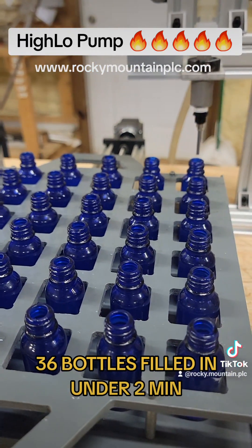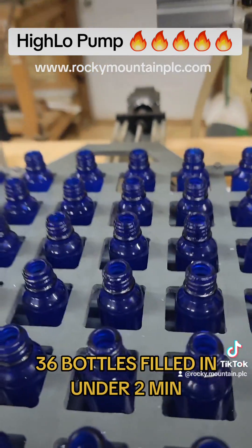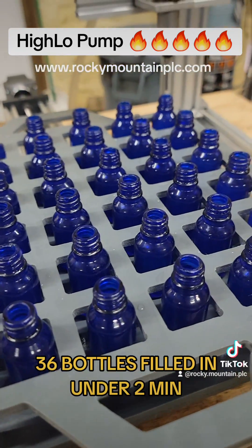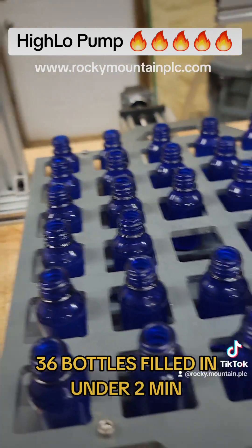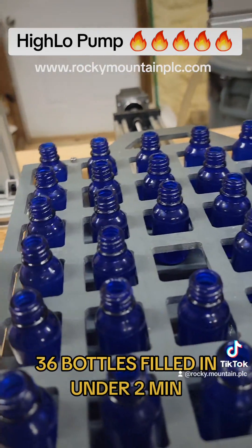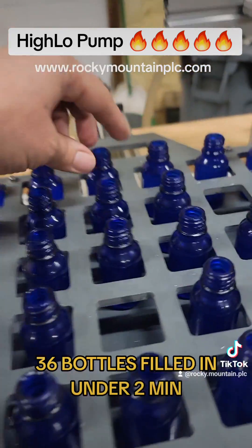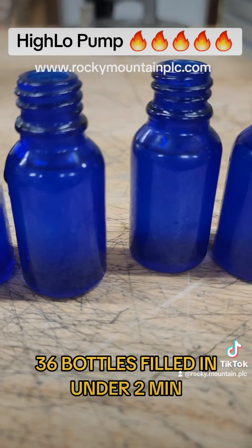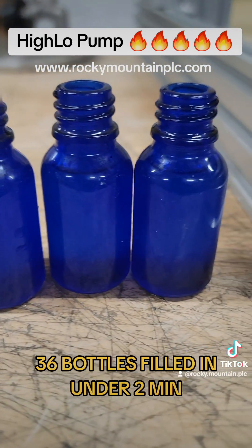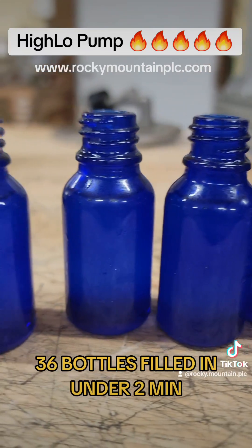We filled 36, 15 ml bottles in under 2 minutes — it was 1 minute and 59 seconds. I showed you the speed of it; everyone probably wants to see accuracy. So let's go ahead and grab a random bottle from each row and check fill volume. Every single one's right at the ring. This would be for a dropper bottle, so that's about where you want it.